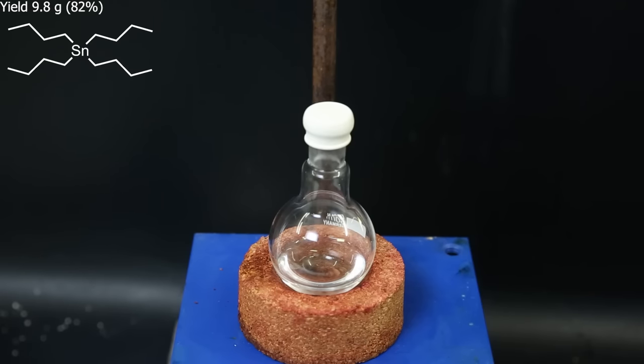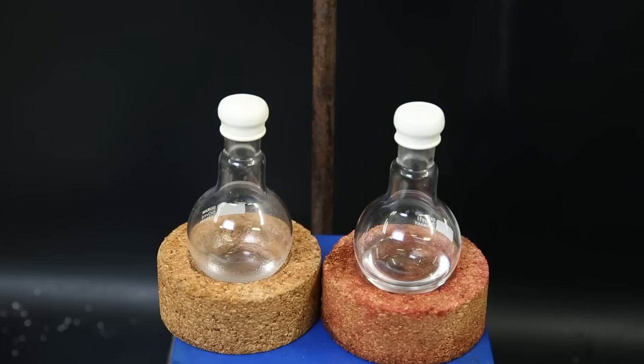Now I can move on with the next step, which is a comproportionation reaction. So what I want is tributyl tin chloride, but I have tetrabutyl tin. So to make tributyl tin chloride, I can use the tin chloride that is set aside at the beginning.